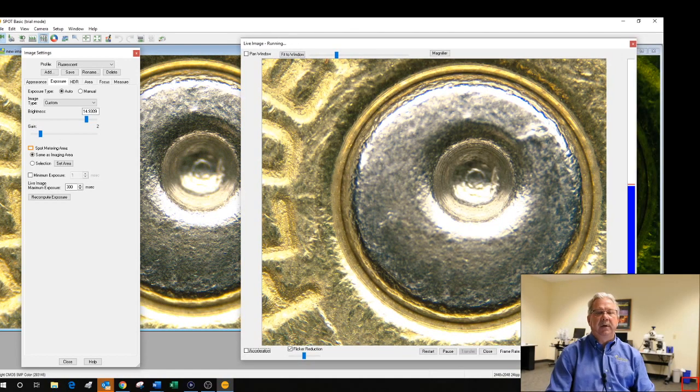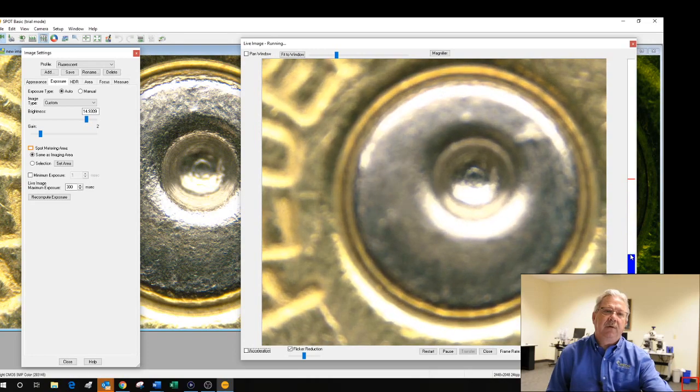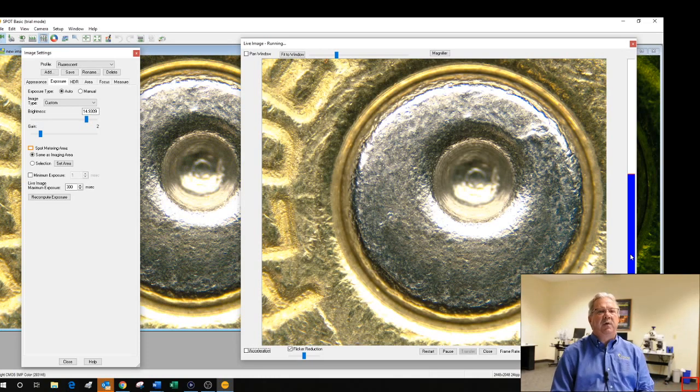By the way, one of the questions that I get asked very commonly, and I don't get all the direct feedback from you, is this stupid blue line in the corner. That blue line is trying to define focus. It's supposed to be a focus gauge with the idea that if you go in and out of focus, you will find a spot, which is the red line, which was the peak focus, if you will. Our samples are so three-dimensional, it really doesn't work.